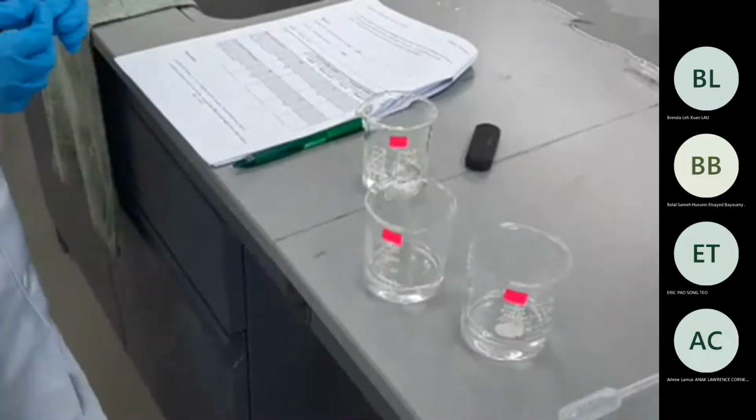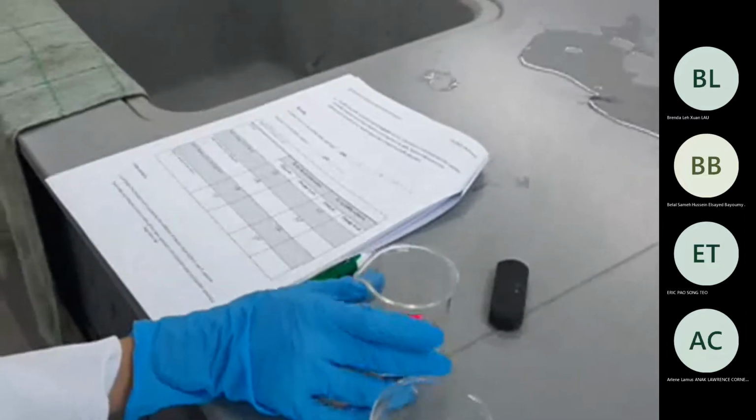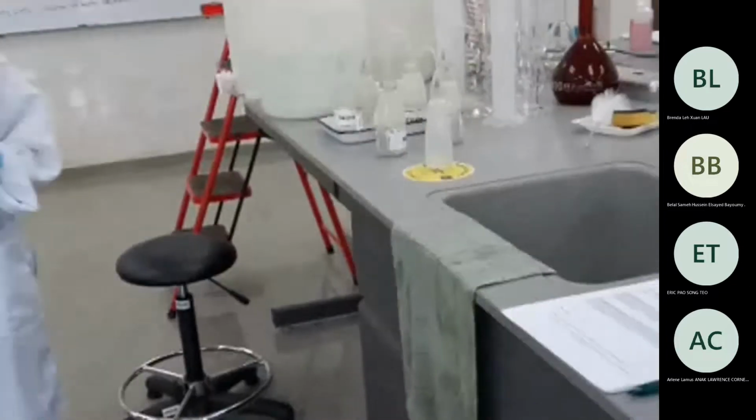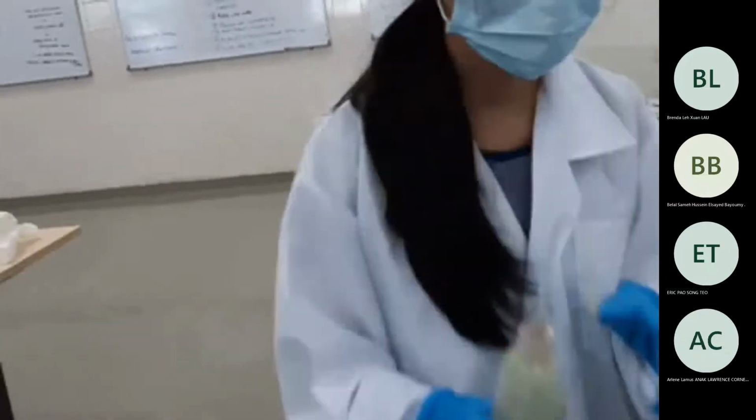Now take the second beaker, go and add 0.1 molar sodium hydroxide, which will be in the fume hood 5. And okay, no, you have to take it out from here and rinse the probe with distilled water. Where is the distilled water? Take the distilled water from there. Rinse it here inside, just rinse.